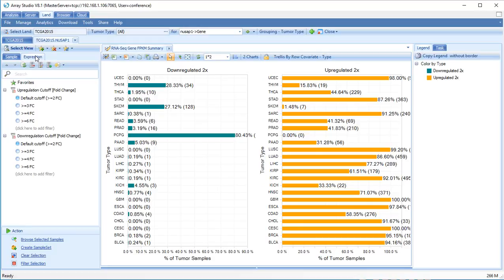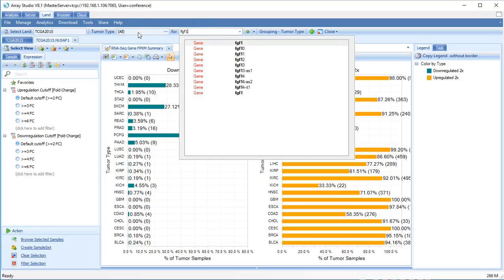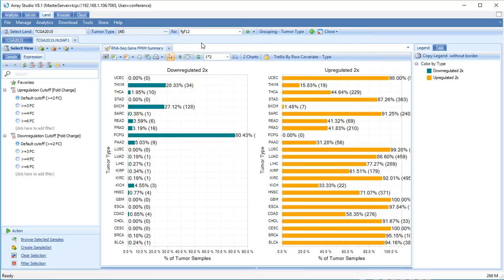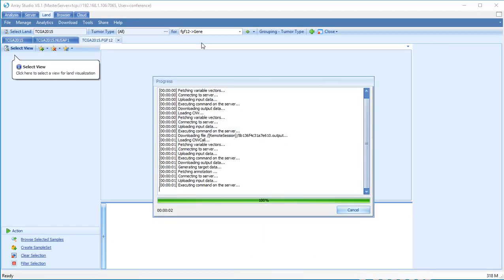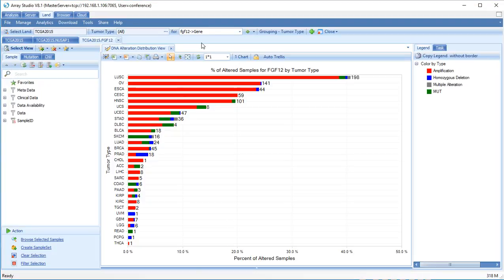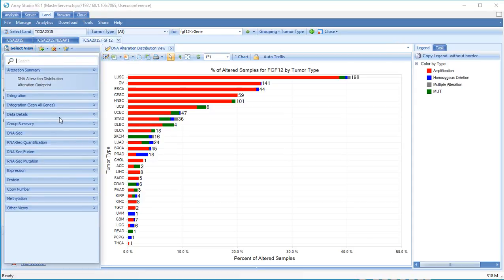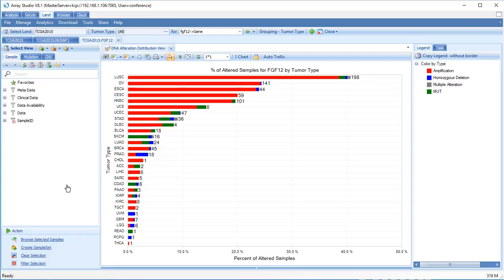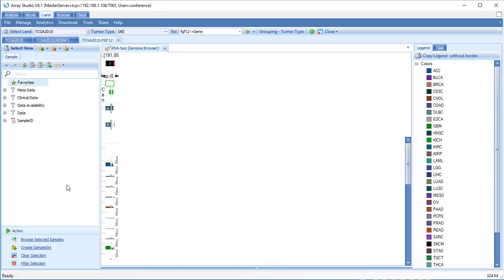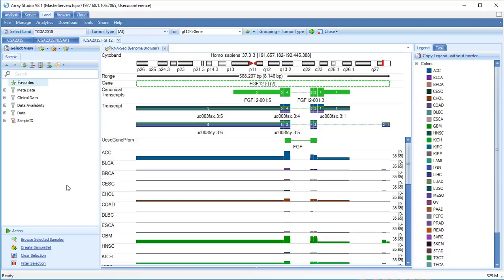What if we want to detect FGF12 transcript differences in a single tumor type? Type FGF12 in the search box. Open the genome browser exon details view, then filter for prostate adenocarcinoma, which is PRAD.